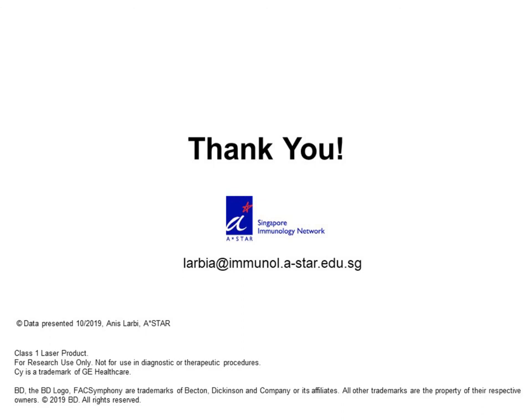This is quite important, especially for intracellular staining, as often your positive cells, in the case of a cytokine analysis, may represent just a tiny fraction of the whole population. It's not unusual to have 5, 10 or 15% of dead events, especially when the freeze-thaw process is not well mastered, or when the dissociation process is quite harsh. Sometimes you need it for some tissue.